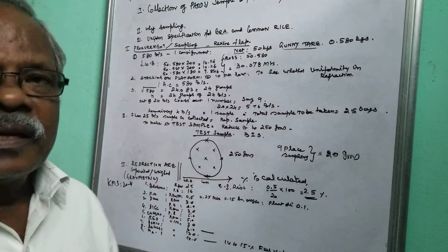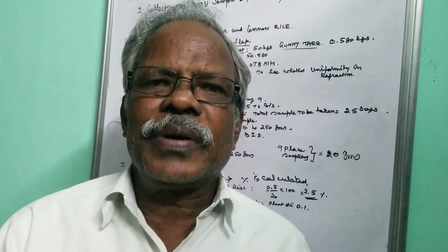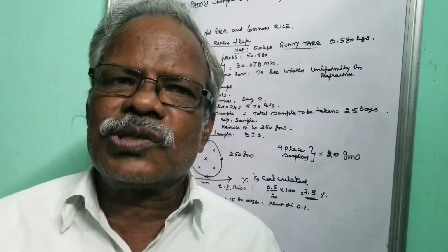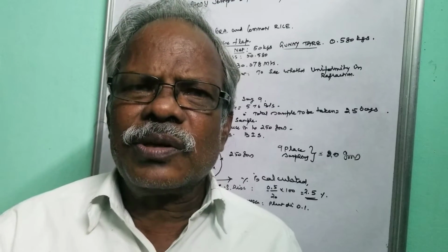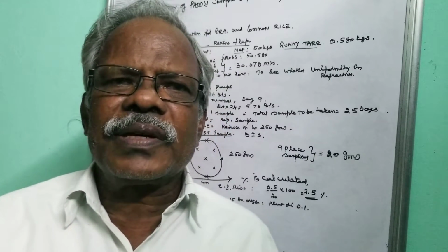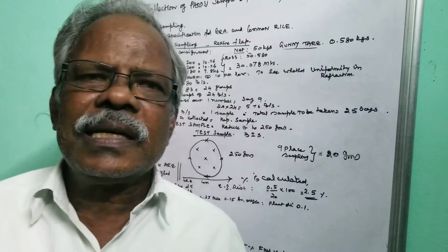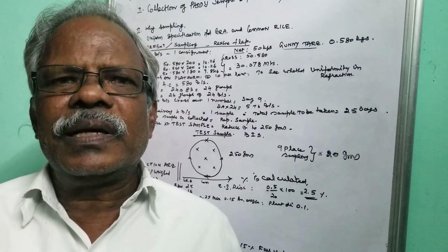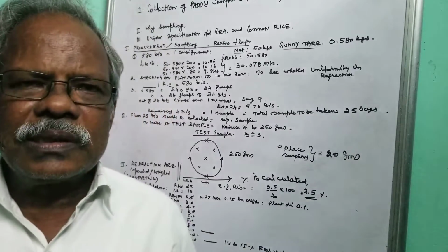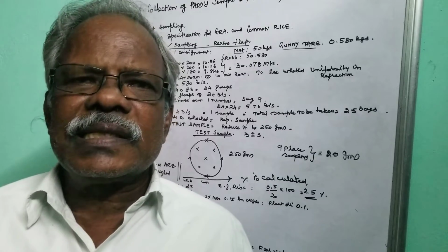So first we'll see the collection of paddy samples from various points taken up by the Ministry of Food and Agriculture and also the apex body, that is FCI. Before arriving at the uniform specification, the Ministry of Food and Agriculture will take samples from various places and analyze them with reference to refractions and other parameters also, the lodging quality, yield per hectare and the keeping quality. All these things they will see.